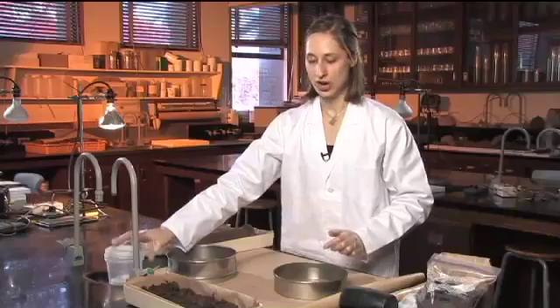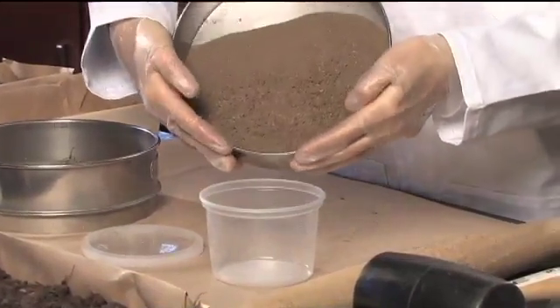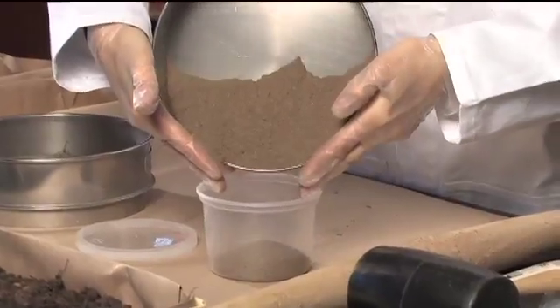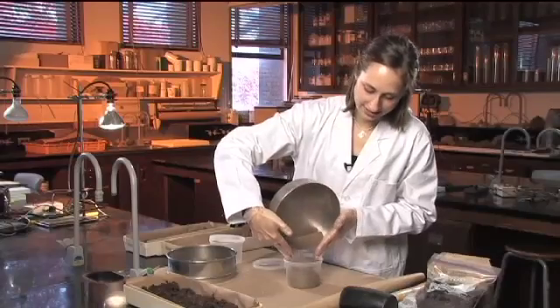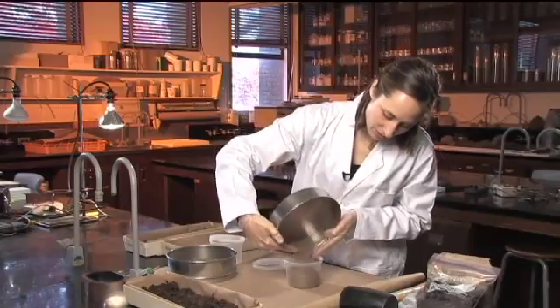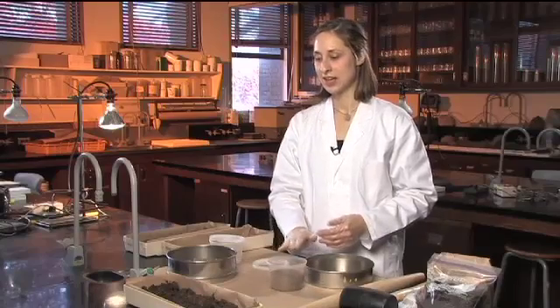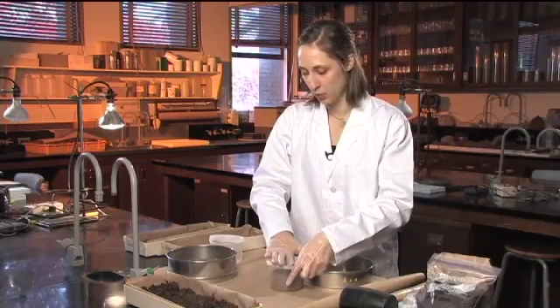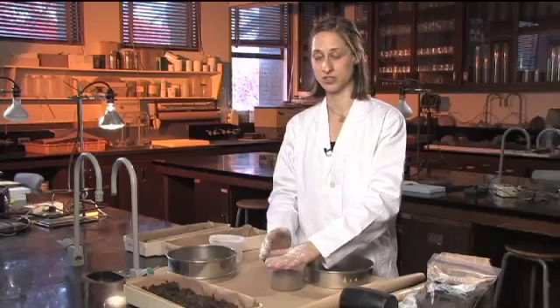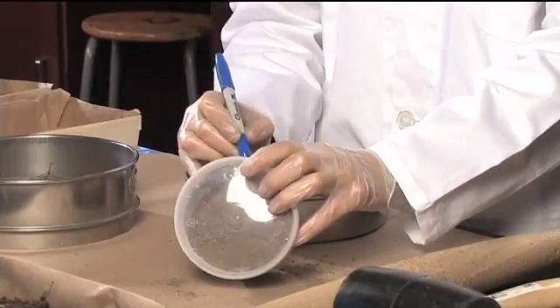You want to store your samples in a cool dry place — you can store them in plastic or in paper. Before you do any other analysis, keep in mind some of the standard measures you might want to do on your soil, such as pH or a moisture determination, which means you would have needed to keep some of your moist sample. Those might be important in determining the type of analysis or procedures you do later on. And of course, before you store it, you want to make sure that your sample is clearly labeled.